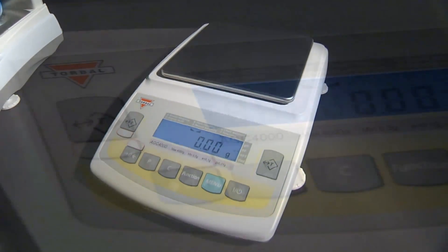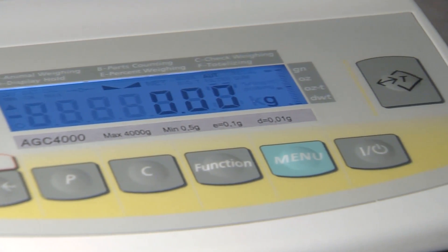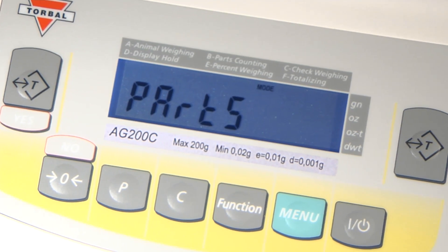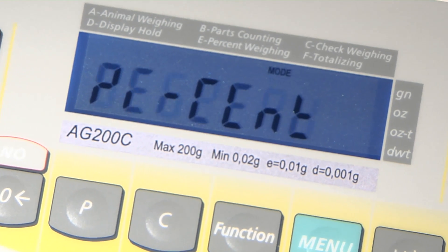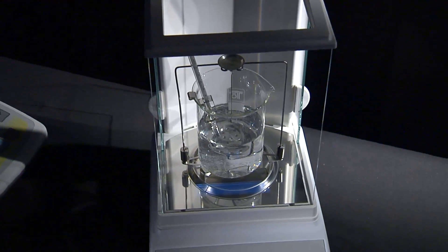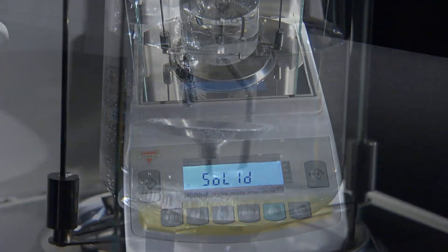Every unit features a sealed front panel that includes dual tear keys conveniently located on both sides of the display, as well as six function keys located at the bottom of the LCD. The AGC incorporates seven application modes including parts counting, animal and dynamic weighing, percent weight, totalizing, and more. The AGC-M analytical balances are also equipped with a density measurement feature that allows the use of a density kit designed for fast density determination.